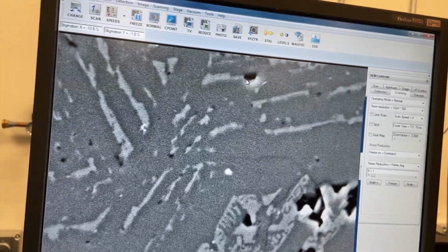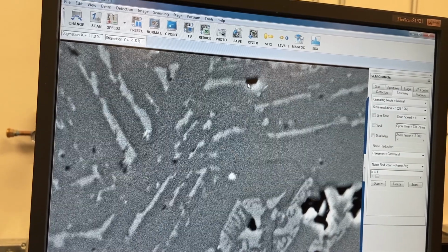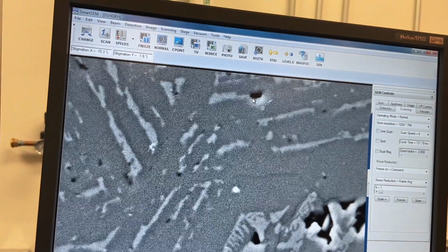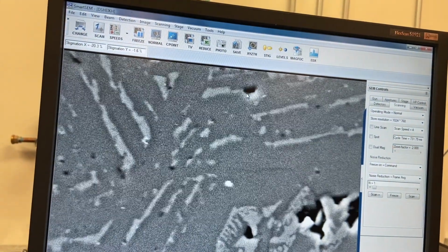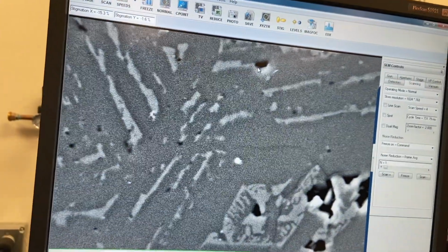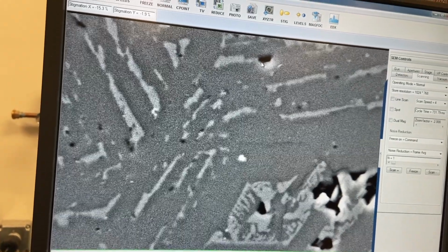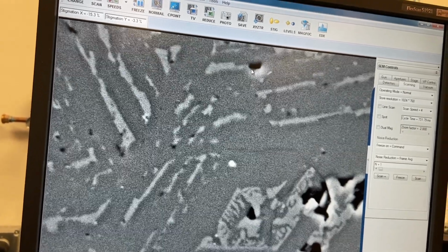Let me do the stigmators now. So stigmators, again: when you have stigmation, your electron beam as it goes down, instead of forming a circle, you're going to get more of an ellipse. So you're trying to keep it as circular as possible. Otherwise, you're going to get distortions, as you can see right there. You see when I do this, you see how it gets blurry? So we're essentially trying to reduce that and get the best quality images we can. So let's do that. There we go.